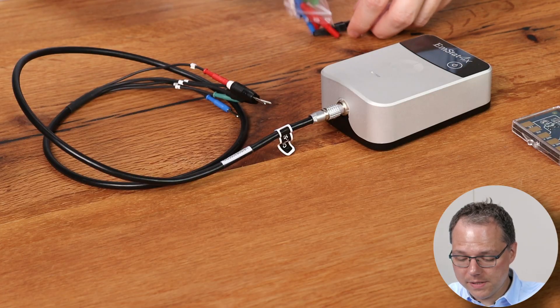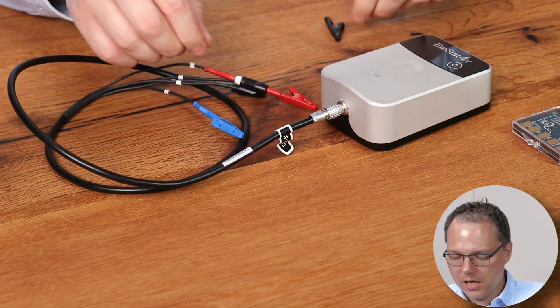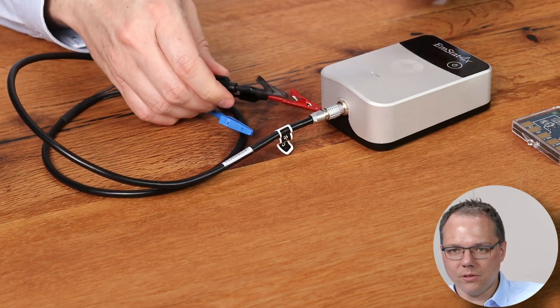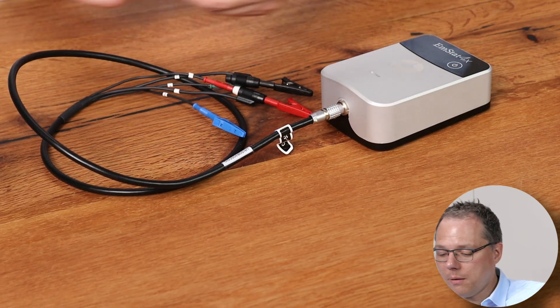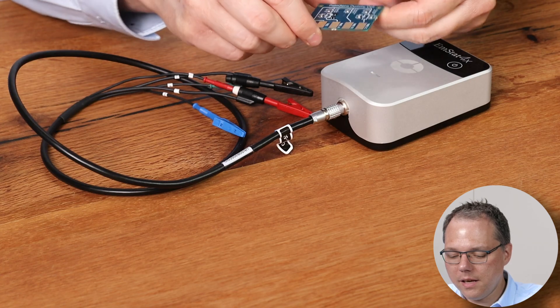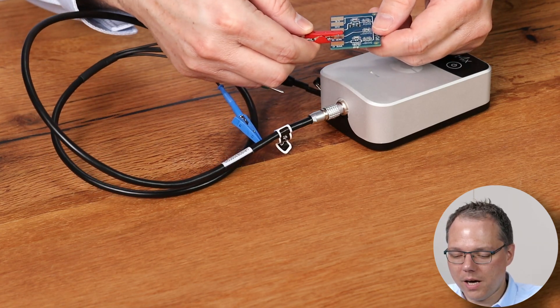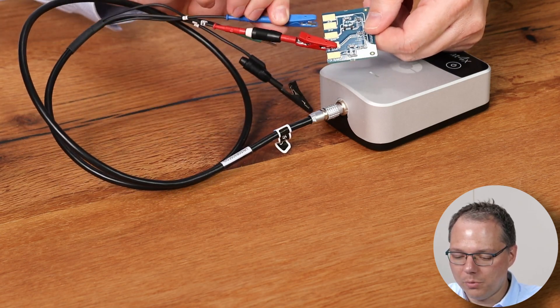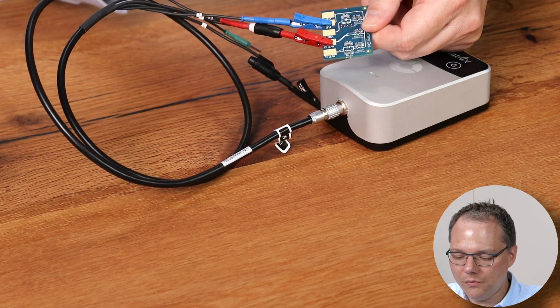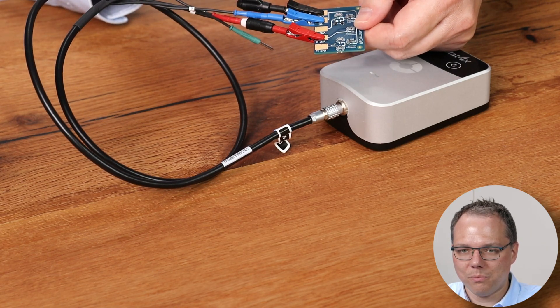You should connect your working electrode to the sense lead, which is marked white. For the dummy cell we need the crocodile clips: the red one for the working electrode, the blue one for the reference electrode, and the black one for the counter electrode. I'm going to choose the 10 kilo ohm resistor, which is working electrode B on the dummy cell. I connect the working electrode to working electrode B, the blue reference electrode to the reference electrode pad, and the black counter electrode to the counter electrode pad.